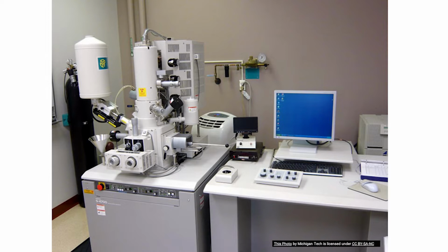Okay, so light microscopes and the electron ones both illuminate the specimens to generate images that our eyes can see, but the electron microscopes use electron beam instead of light beams for the illumination. And that makes a massive difference, because electrons, when they behave as a wave, have much shorter wavelength than the light wave. And because of this, they can separate two objects better. They can get higher resolutions.